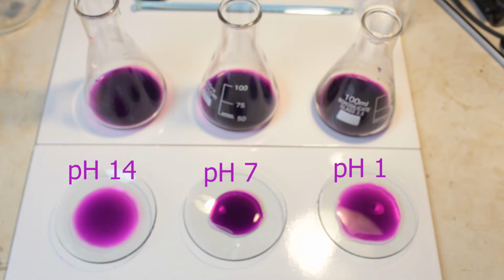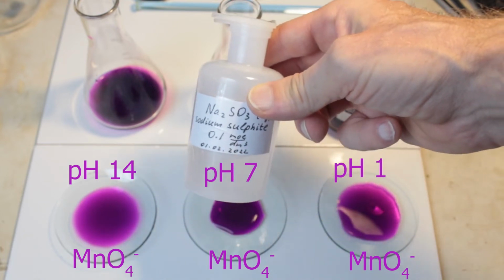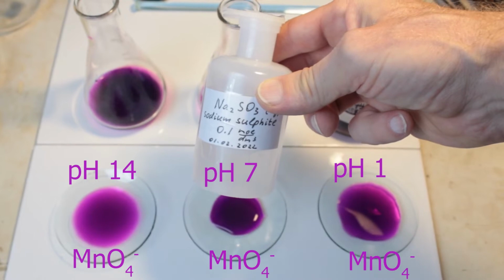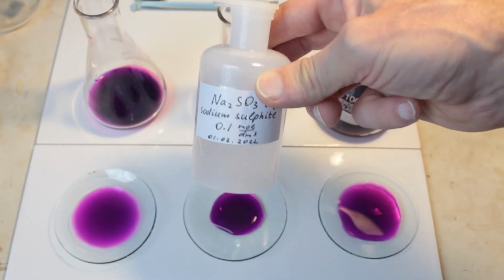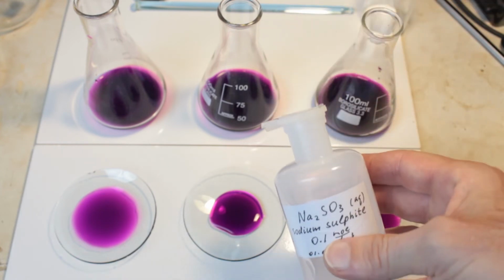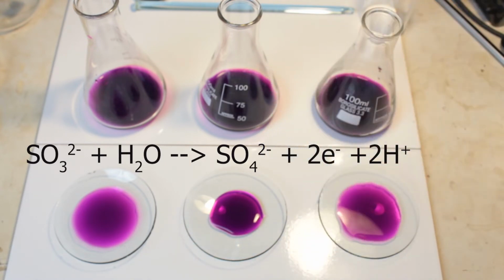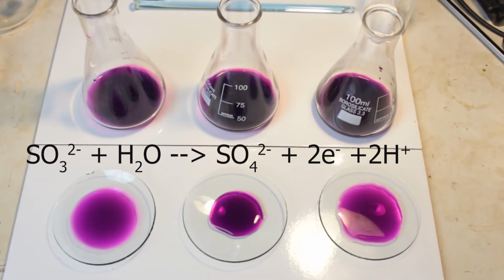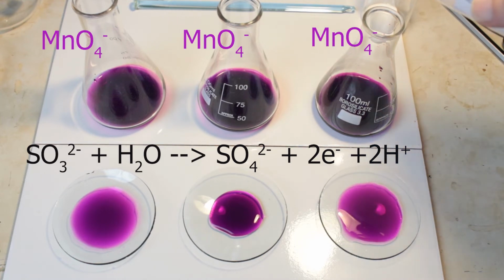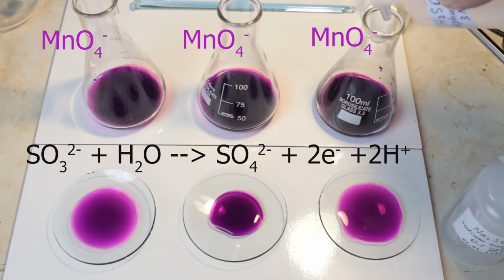Now, it's the time to look at the reducing agent which I use. It's sodium sulfite, or another name, sodium sulfate 4. Oxidation state of sulfur is 4 here. It's SO3 2-, not SO4 2- as in sulfate. Sulfate though is stable oxidation state +6. So you see, sulfite is oxidized into sulfate, giving 2 electrons away. Sulfite is colorless, sulfate is colorless. All color changes would be due to changes in manganese ions.